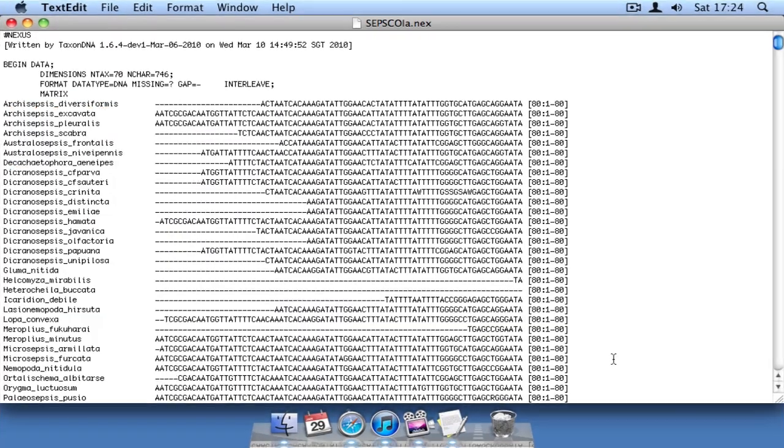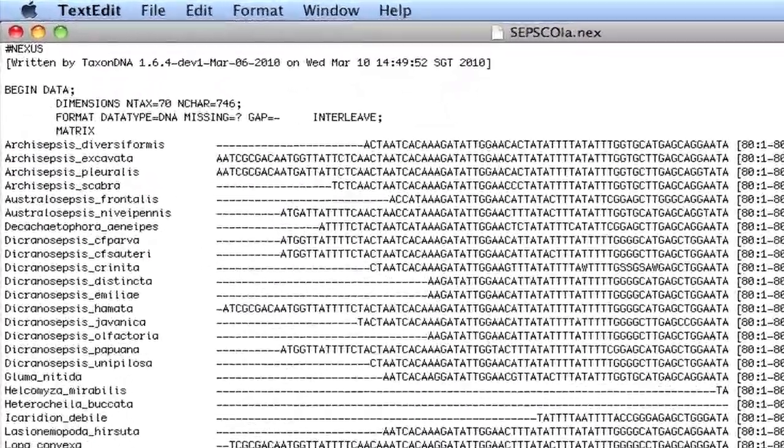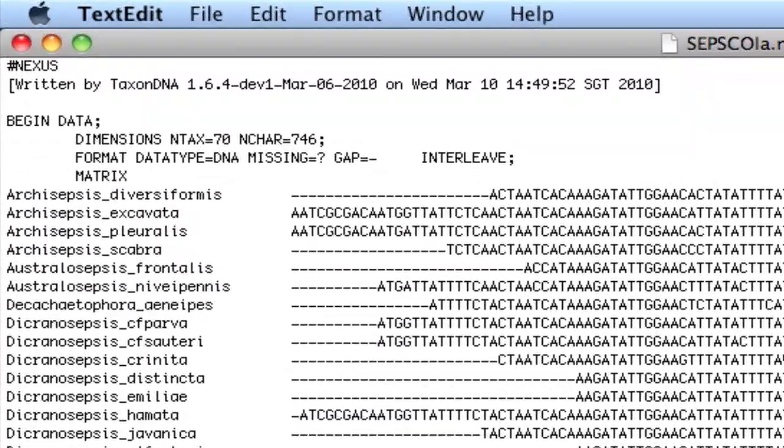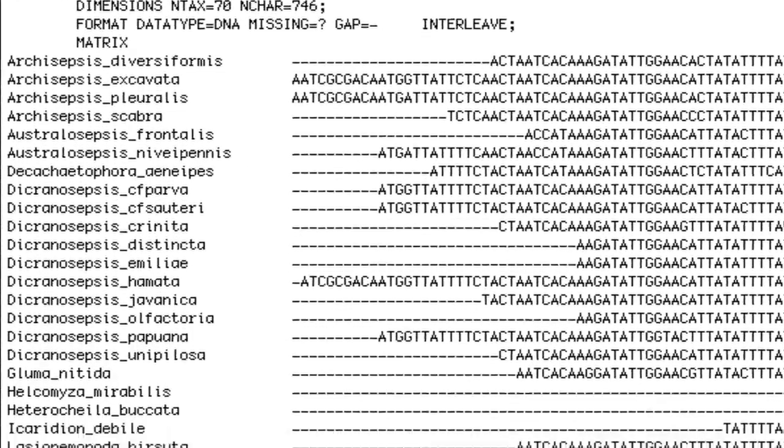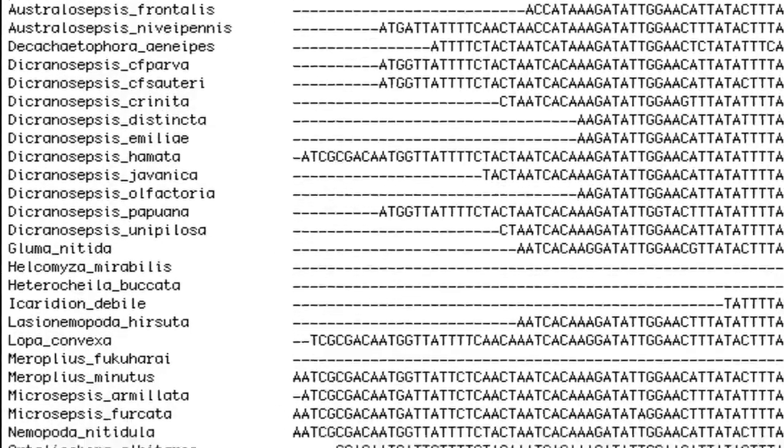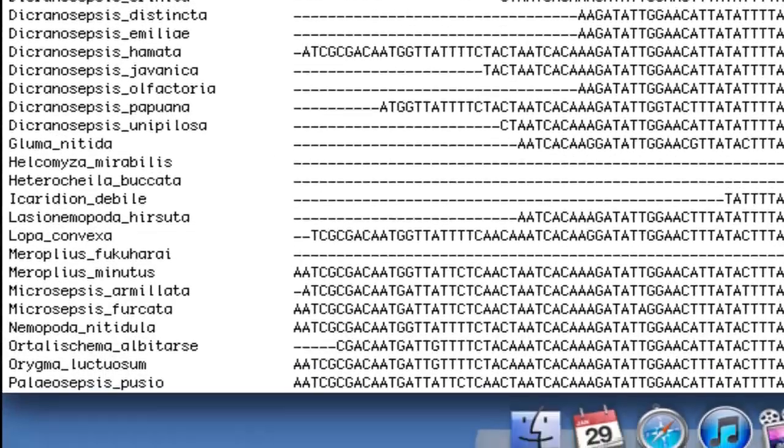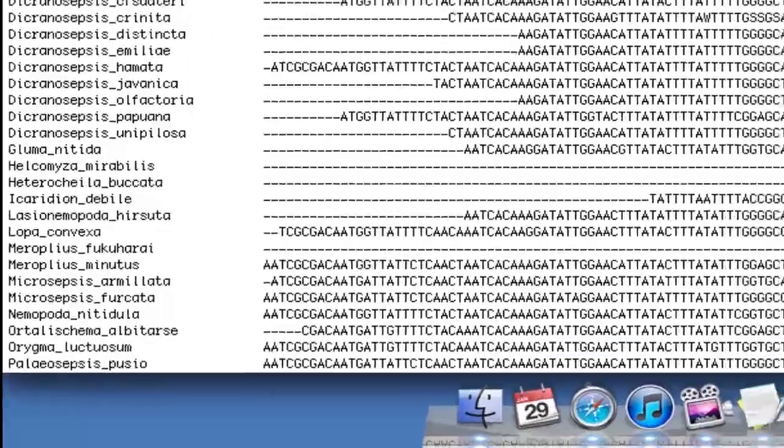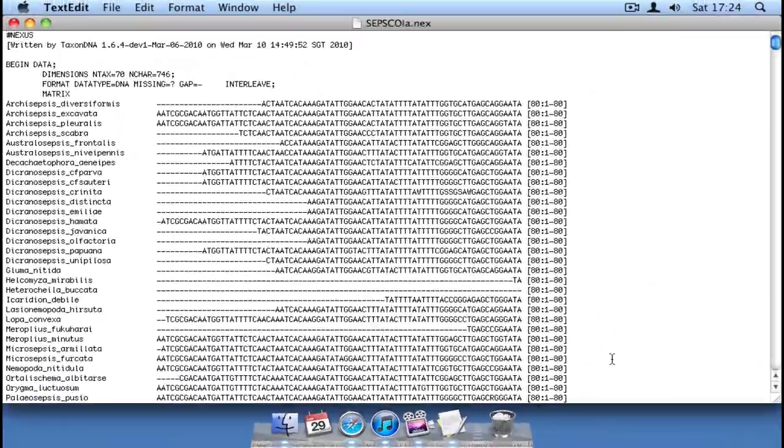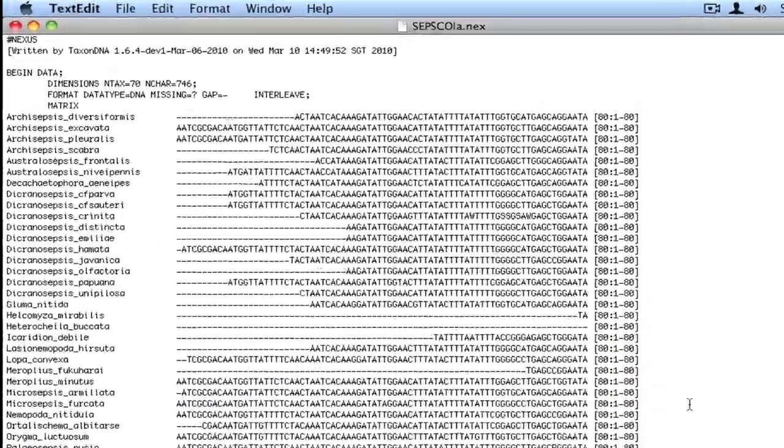Sequence Matrix uses taxon names to identify different sequences from the same sample in different Nexus files. Now these taxon names can be species names, as we've used here, or specimen codes, or almost anything else, but it's important that the names be consistent across each of the component Nexus files.